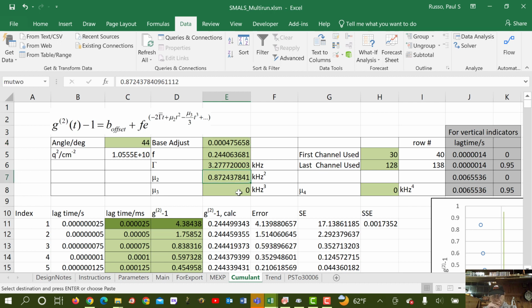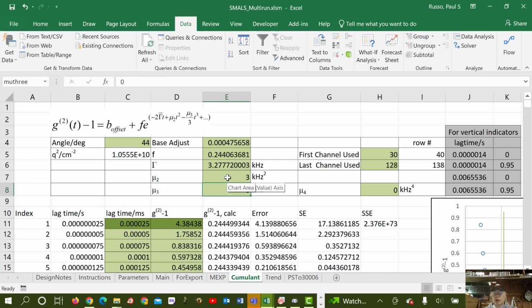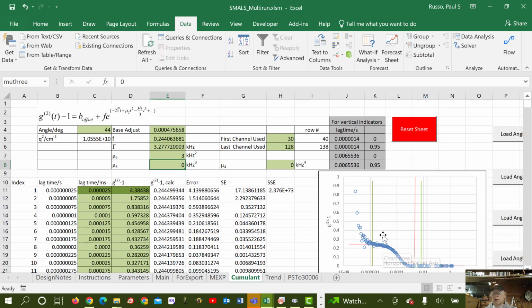I find, even though Solver is programmed to do multi-start, starts with different parameters, it's sometimes helpful to go and just change these a little bit. So let's go ahead and change this one to, okay. I think that will probably not produce anything that you would really see. Maybe in the tail here, let's see what that does. Let's change that back to 0. Well, 0, of course, it doesn't blow up on you. Okay. Let's change it to 5. Now it blows up way too soon.